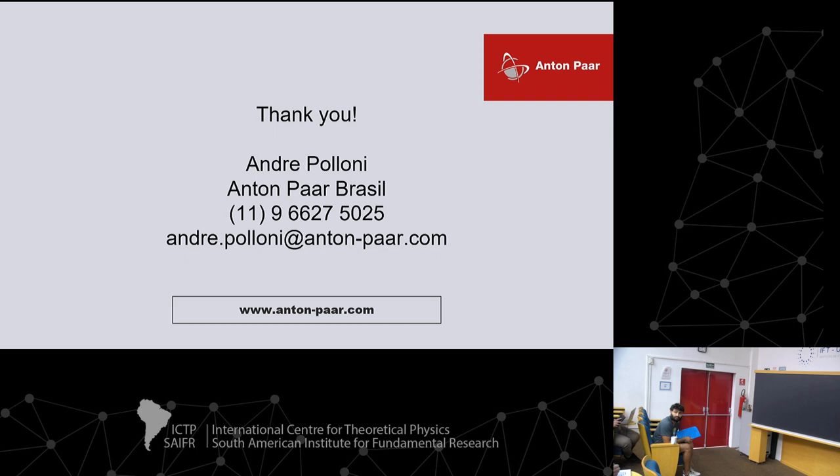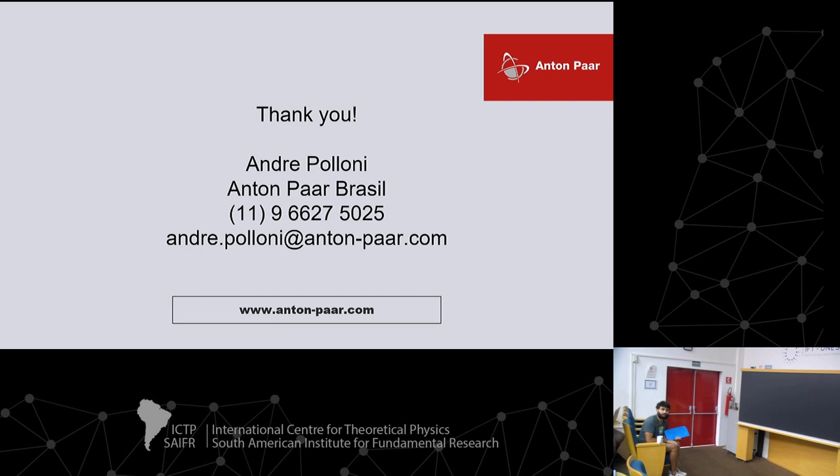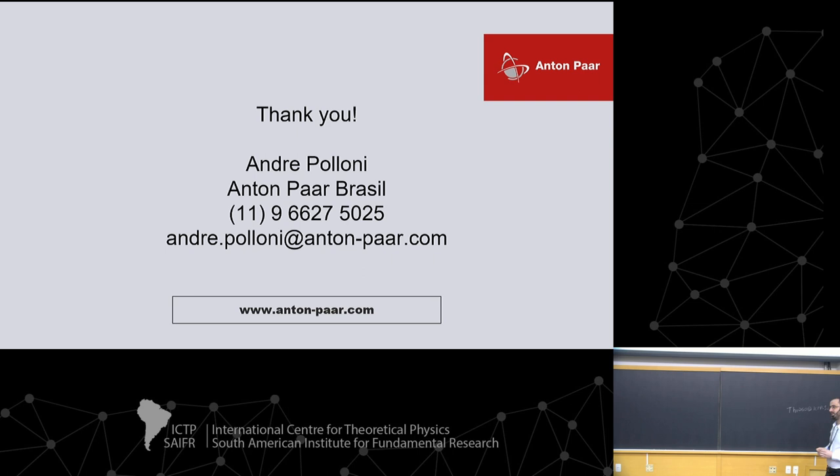This would be kind of like a fractal, right? I was wondering, because the surface would be kind of like a fractal, what is the real surface area that you are measuring? It depends more on the sample. But it's a good point, a good question to study and to compare. It's a relatively new technique to measure this kind of properties. But all the results we have until the moment are really in accordance with physisorption, and we are also starting to study chemisorption, how chemisorption affects the morphology of materials by SAXS as well.